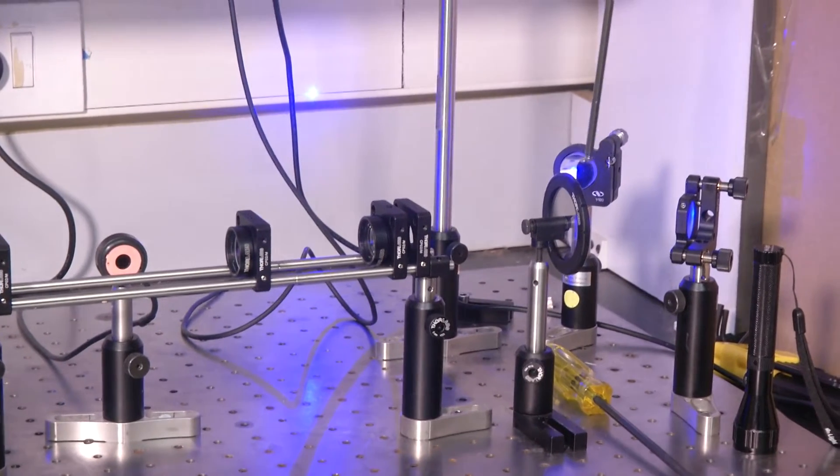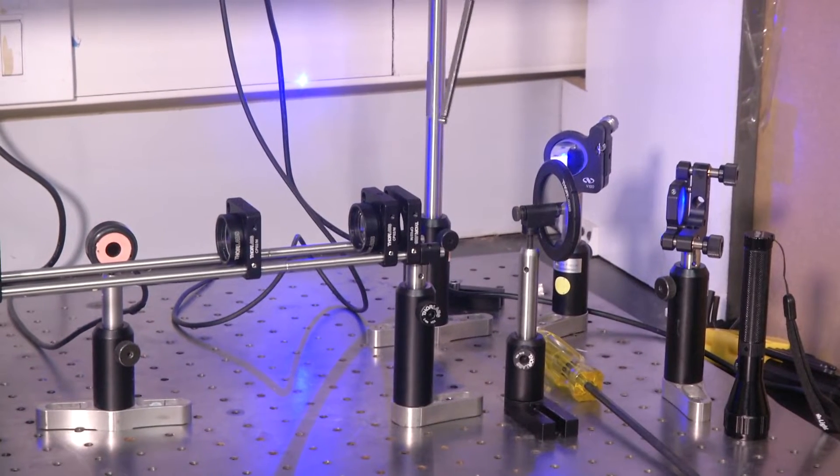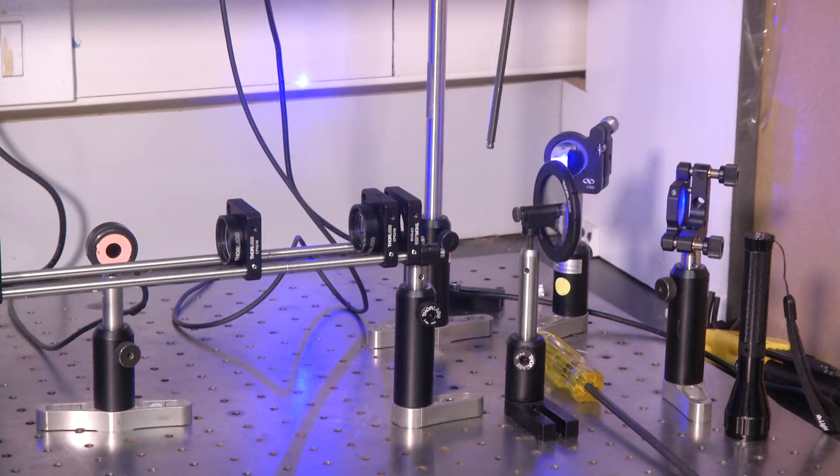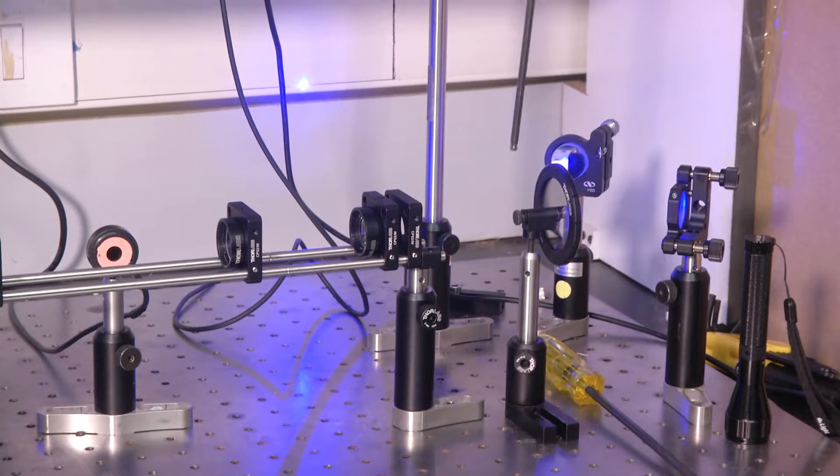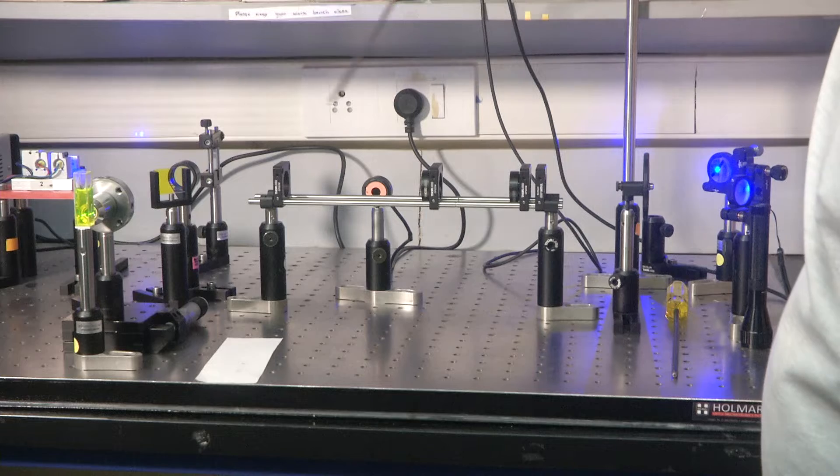One extra part that we have kept here is the neutral density filter. It reduces the intensity so that it's in a range that is good enough for us to actually detect and see things. Until here there is no change at all, and even here there is not much change.